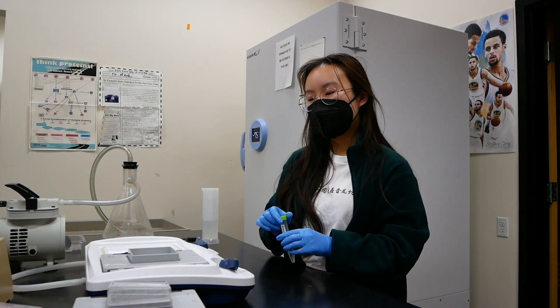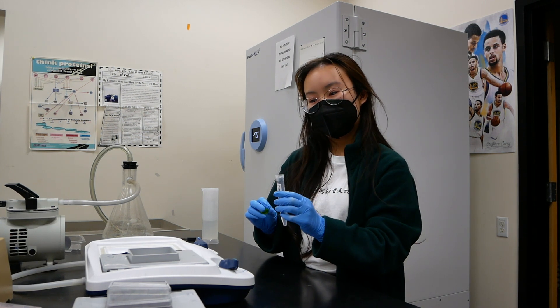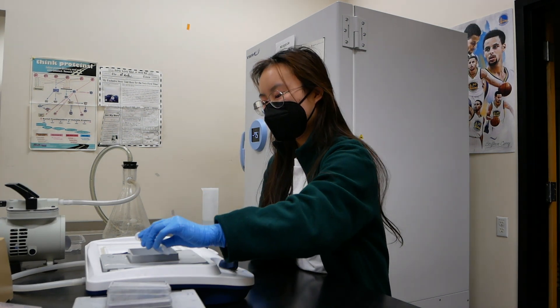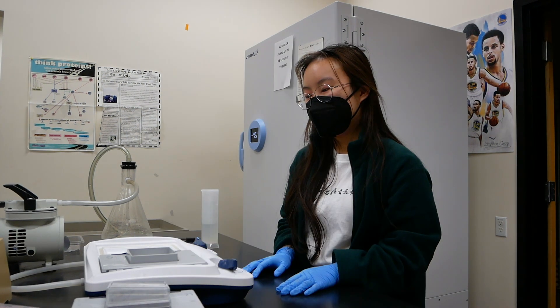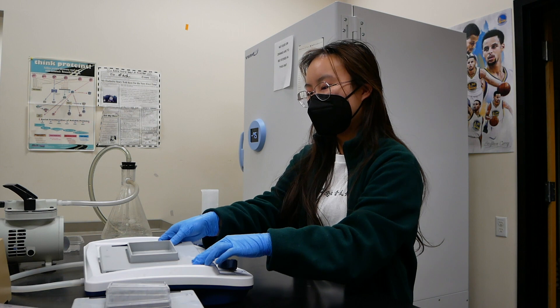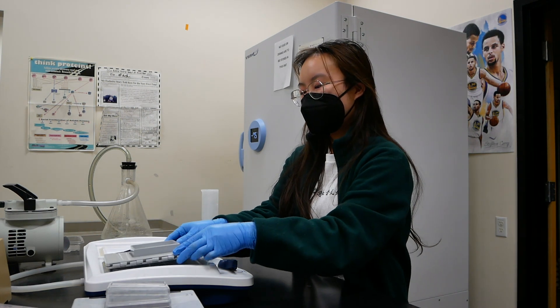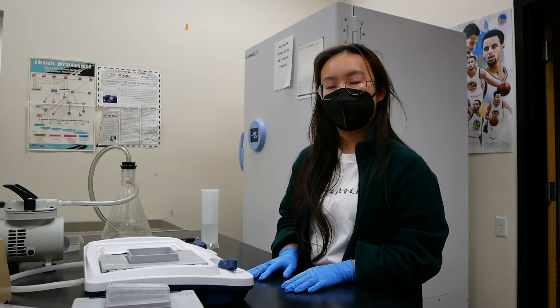We're going to do the same thing with the secondary antibody — drip it on and then let it sit again for 10 minutes. Just like we did with the primary antibody, five minutes into the 10 we are going to check on the membrane and make sure the solution is covering the proteins evenly. Then we're going to wash it four times again with the wash buffer.